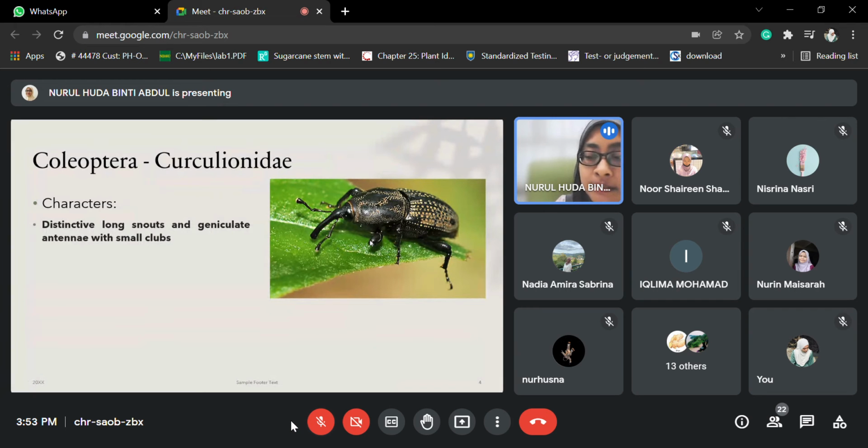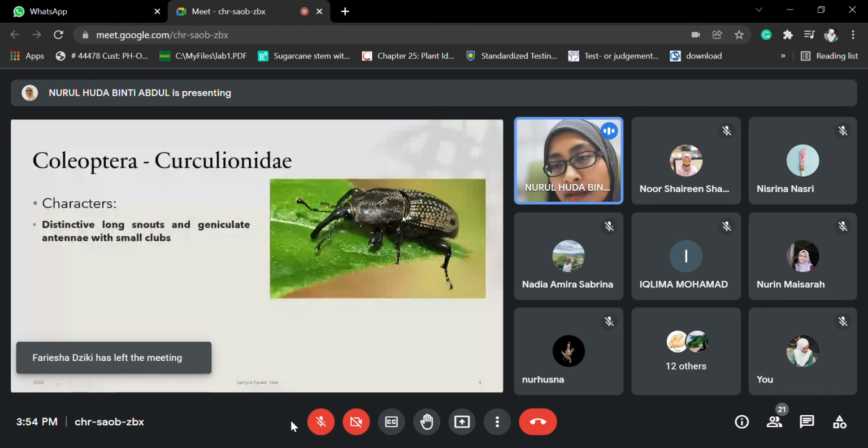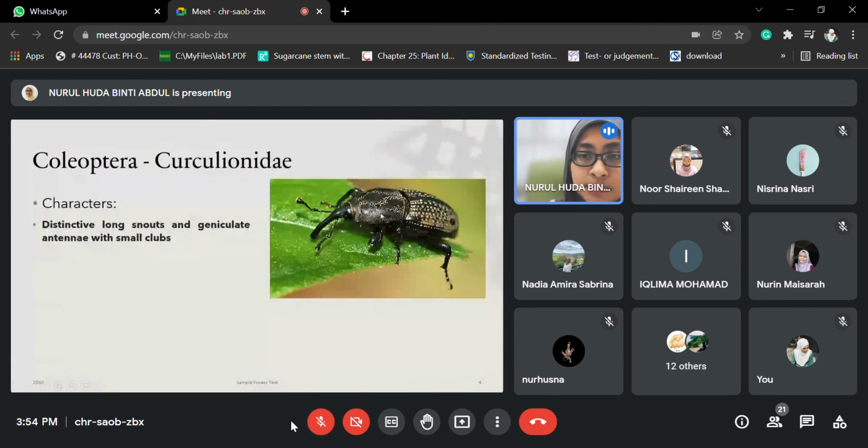Remember I said about punctured, kan dia sculptured or punctured, where if you look at the thorax here, as well as a bit underside of the prothorax and also on the elytra, kamu nampak yang lubang putih-putih, not actually putih, it's actually with dust color chocolate. So this is because dia punya body is actually punctured.